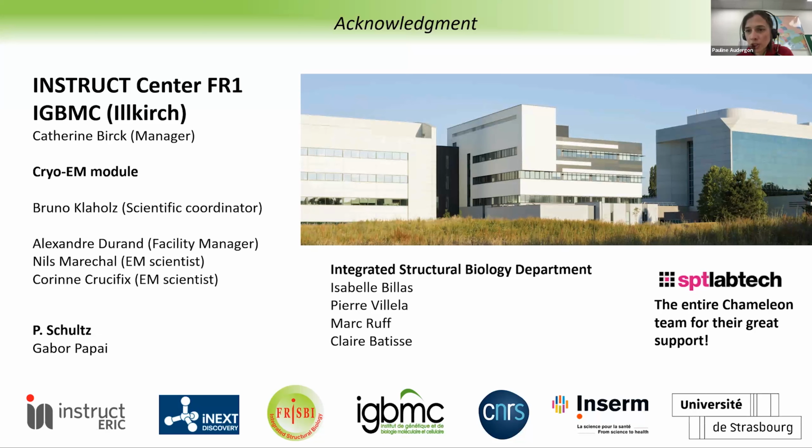And we have a last question from Hugo. With Chameleon, what are your favorite grids for 300 angstrom molecules? So with Chameleon, what is my favorite grid? Yes. What do you mean by this? Maybe we can ask Hugo to ask the question directly if he raises his hand.